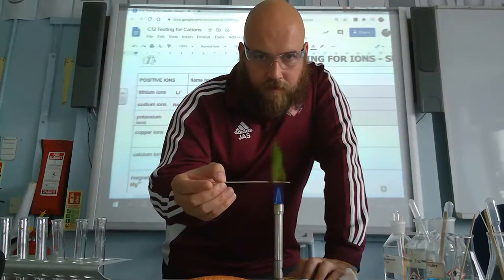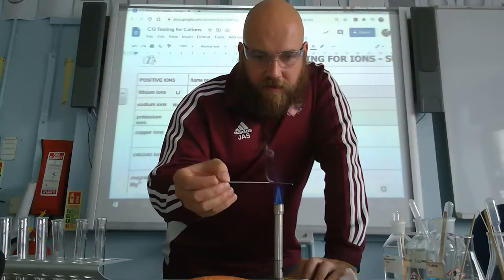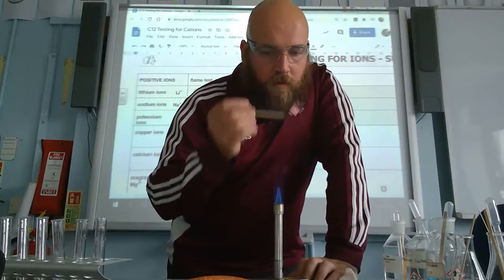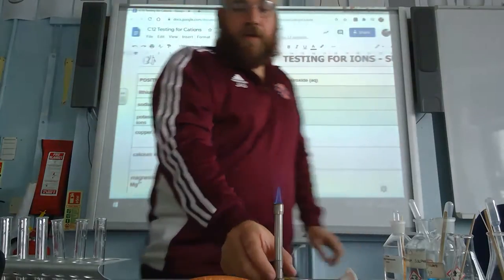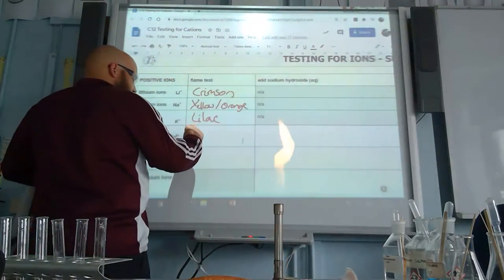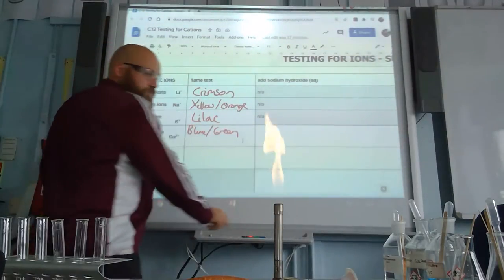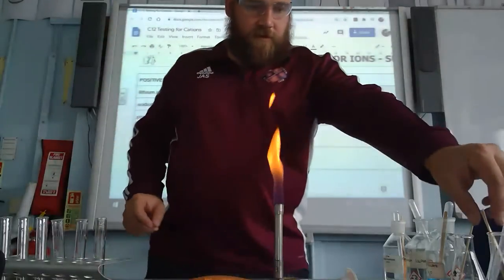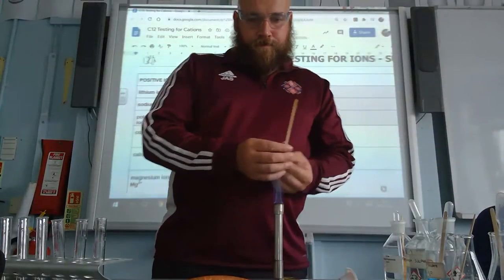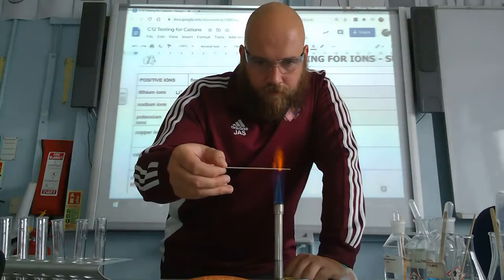Yeah, unmistakable. See that lovely sort of bluey green colour. Yeah, so it's that lovely sort of bluey green colour. And the final one is calcium, which I've got over here. Let's have a look. Well, there we go.